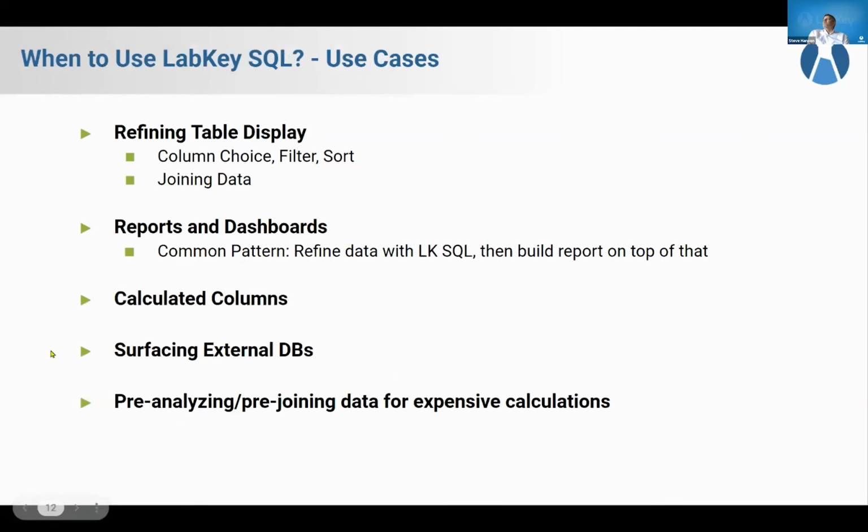So, some use cases: when should I use LabKey SQL? Well, I think the main use case is really about refining table display. It's about making your data focused, compelling, relevant. It's really about focusing on the insight that's in your data. And that's really one of the main benefits of SQL, and of LabKey Server.